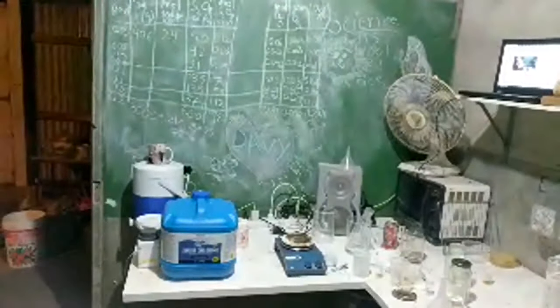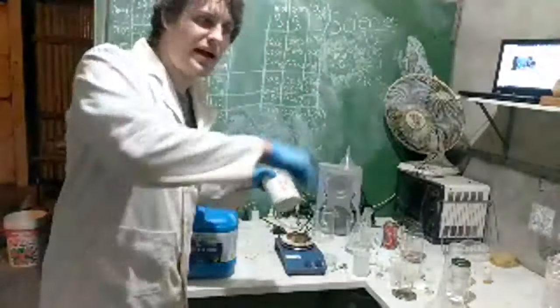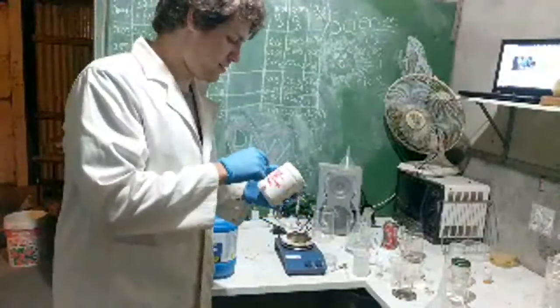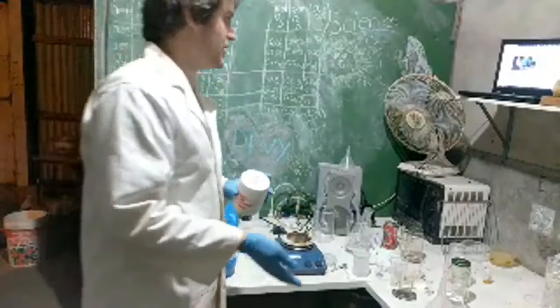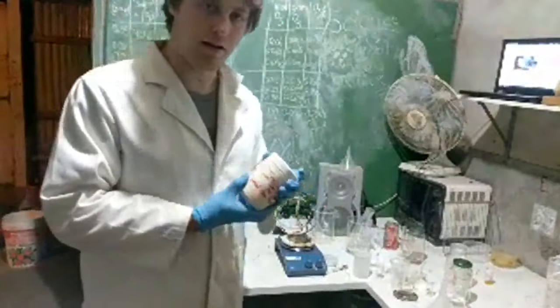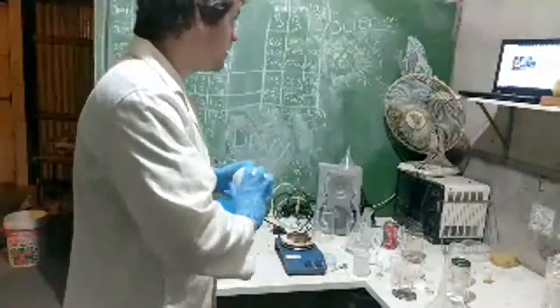Now the big question is, people who are better at chemistry than I am, which is possibly all of you in the chat here, do I need to dissolve the iron oxide up before I add it to the bleach? As far as I understand it, it'll go into iron chloride or iron nitrate, and then I'll put it in the basic solution and it's just going to precipitate iron hydroxide. But can I just skip that and just put iron hydroxide in? You know what I mean?